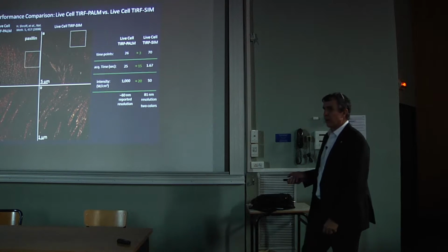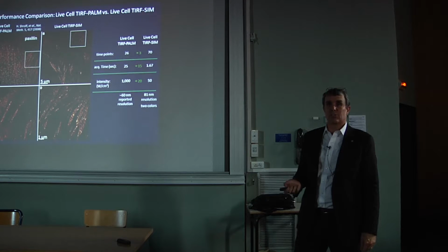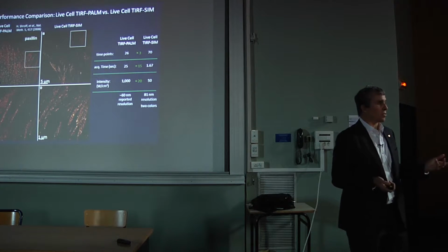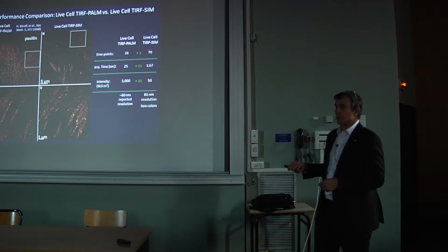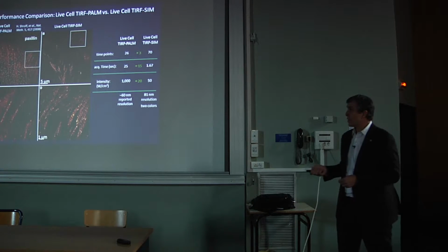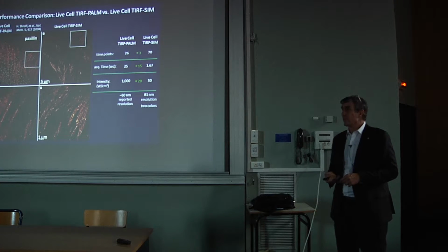So we can compare what we can get now with these high NA versions of structured illumination to the supposedly higher resolution methods of the other super resolution methods. The first comparison I'll make is to my own work back in 2008, when we were able to demonstrate live cell PALM imaging for the first time. In that case, again, we looked at focal adhesions, reported about 60 nanometer resolution as you see here.